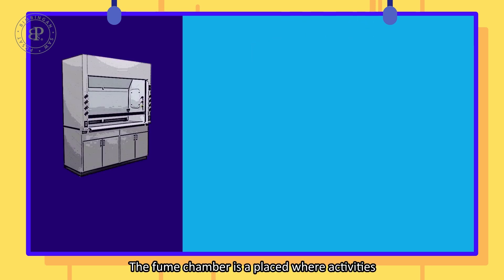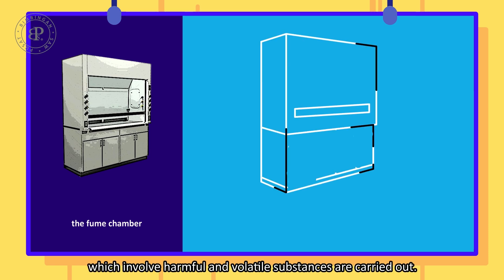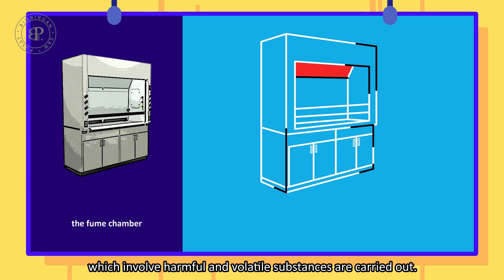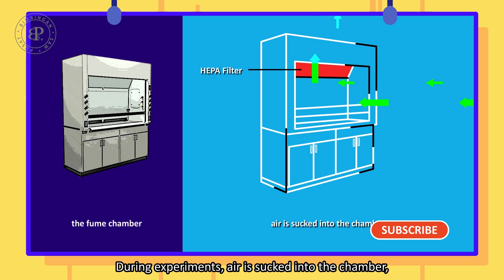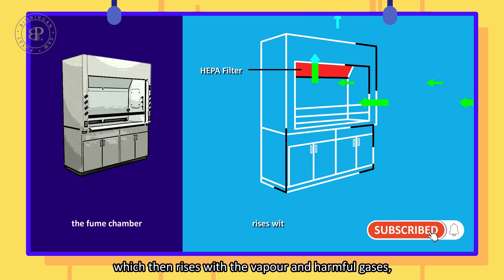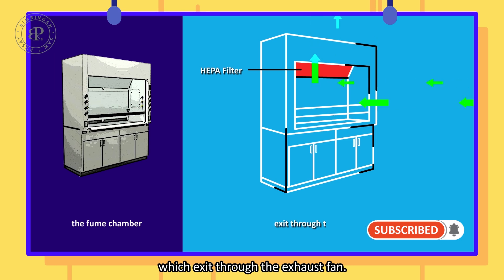The fume chamber is a place where activities which involve harmful and volatile substances are carried out. During experiments, air is sucked into the chamber, which then rises with the vapour and harmful gases, which exit through the exhaust fan.